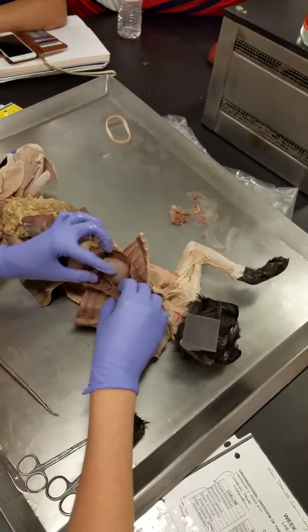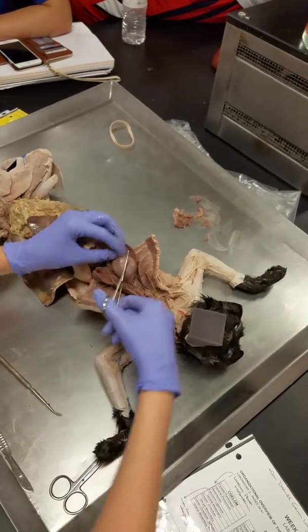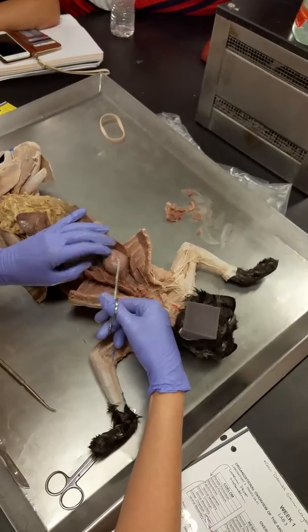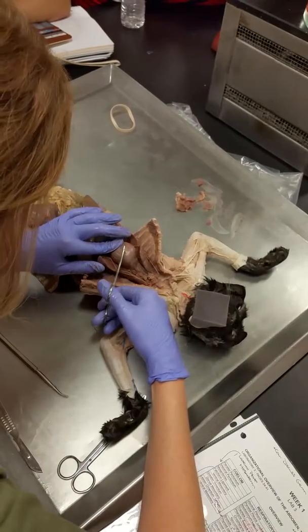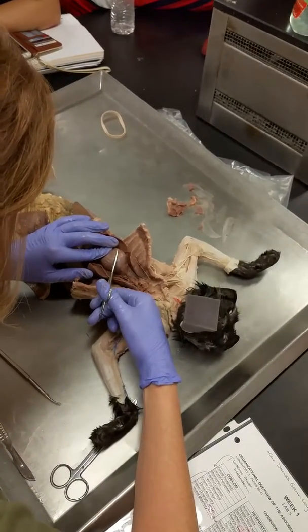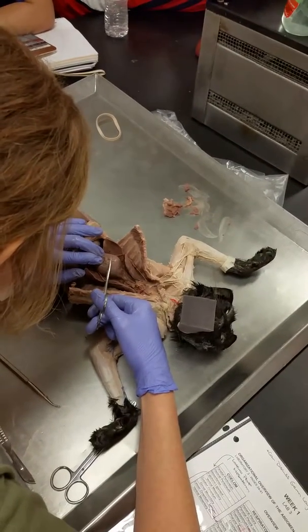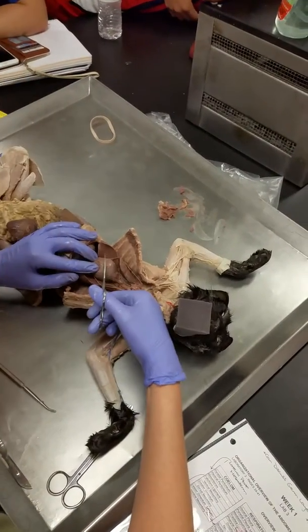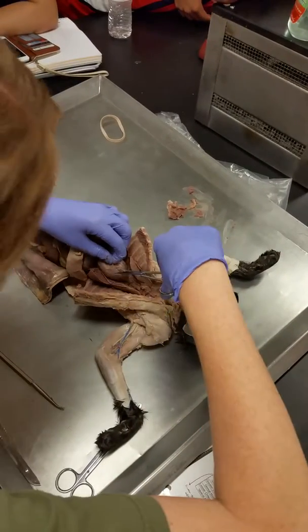Okay, all right, so now I've got both of my phrenics off here. So what I'm going to do now is I'm just going to gently cut a hole. These scissors are not very sharp. My other ones are better. I'm going to cut a hole into this, just like that. Okay, so we're just going to cut a hole into this pericardium here.